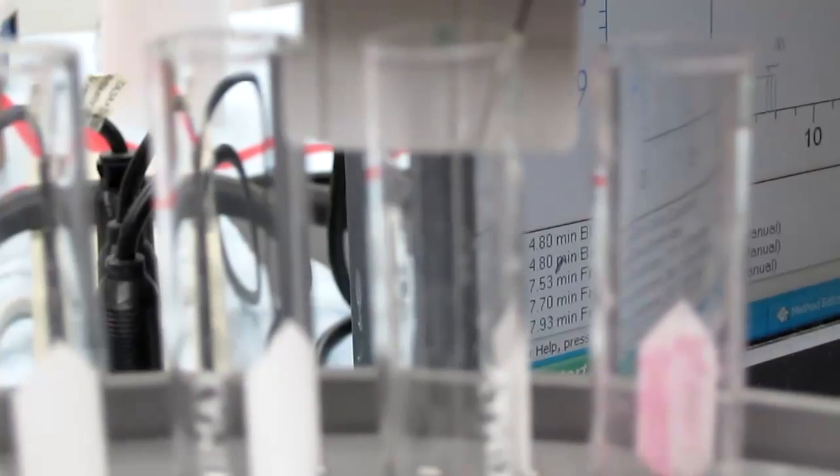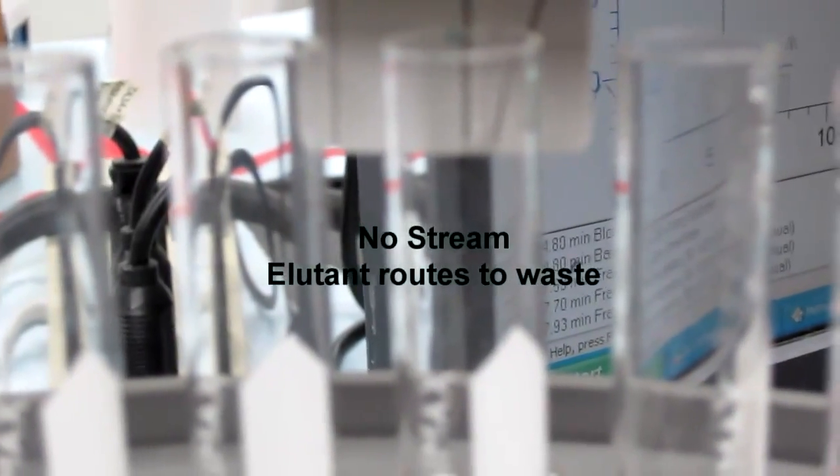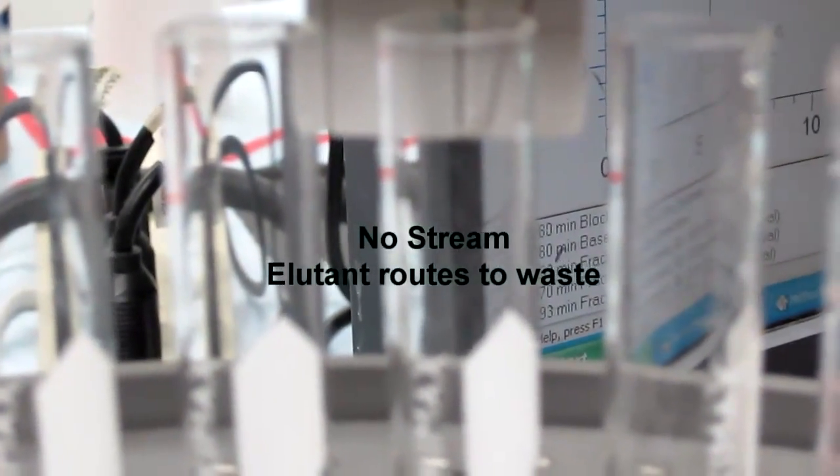Inserting a zero in the message box will stop collection and reroute the eluent back into the waste. However, the fraction collector will change test tube, it just won't output any eluent into the test tube. Until, of course, you insert a positive number back into the message box, in which the fraction collector will start collecting again into the current test tube.